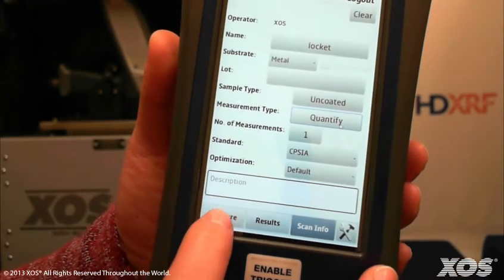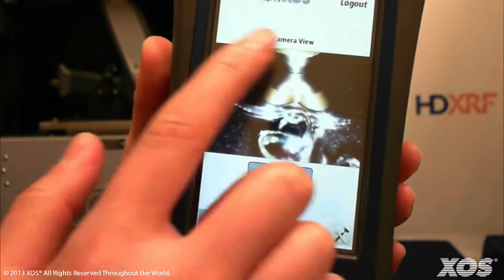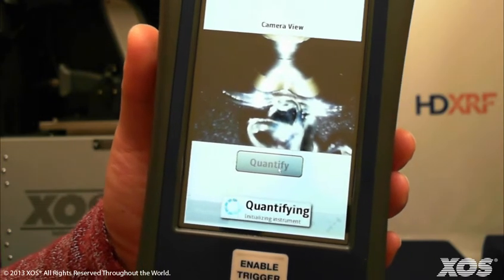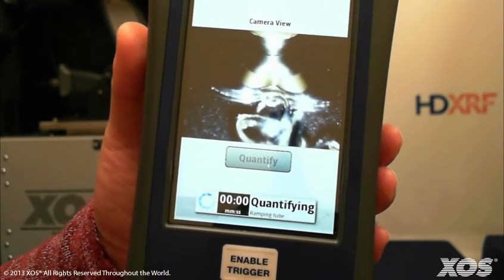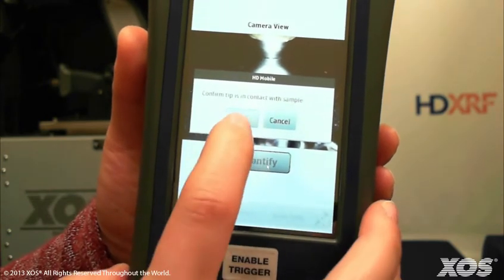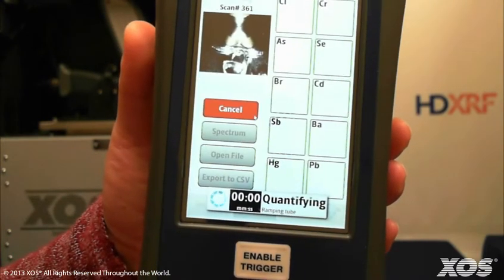To do this, go back to the scan info screen and, for measurement type, this time select quantify. Return to the measure screen where you see the image of the sample and press quantify. Once again, confirm that the tip is in contact with the sample and press OK to continue the measurement.